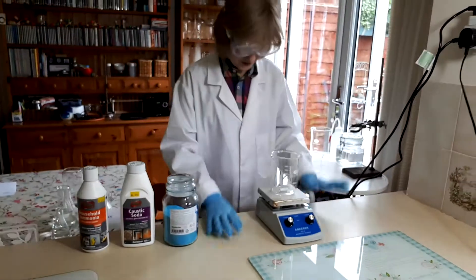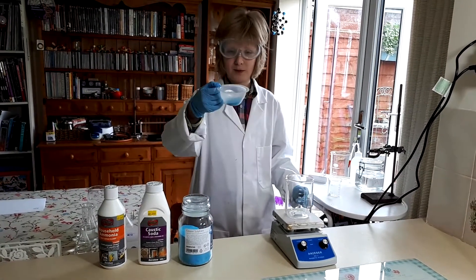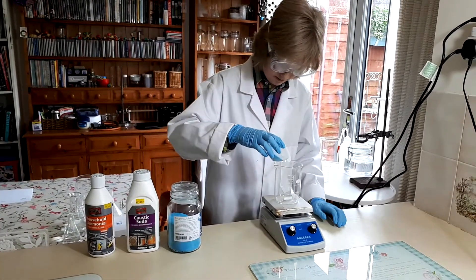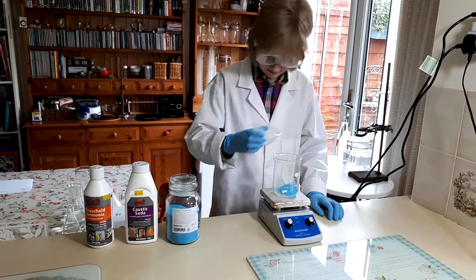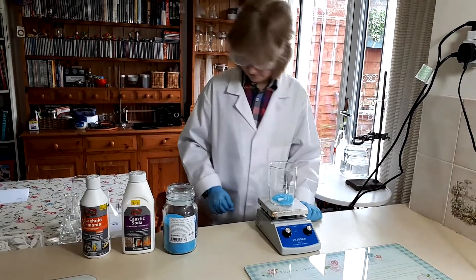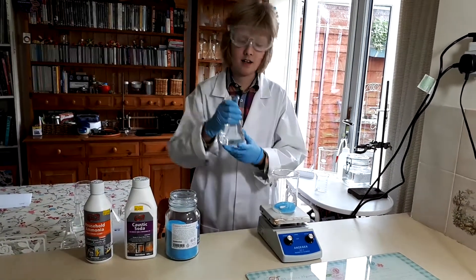First up, you're going to measure about 25 grams of copper sulphate, then you're going to dissolve that in 250 millilitres of water.